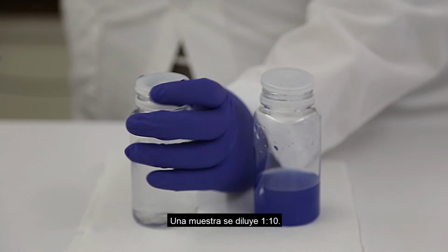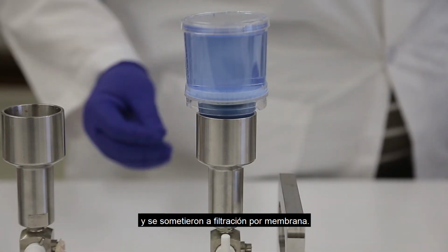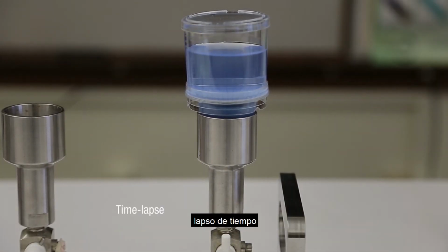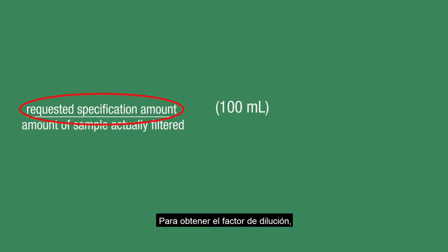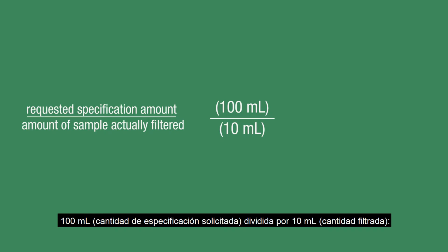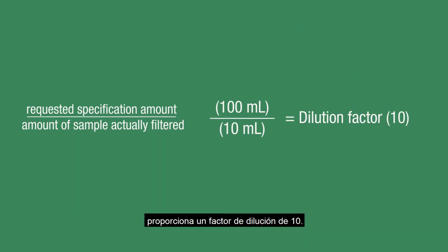A sample is diluted 1 to 10. 10 milliliters of sample was added to 90 milliliters of sterile buffer and underwent membrane filtration. The requested specification amount was 100 milliliters. To find the dilution factor, divide the requested specification amount by the amount of sample actually filtered. 100 milliliters, requested specification amount, divided by 10 milliliters, amount actually filtered, gives a dilution factor of 10.